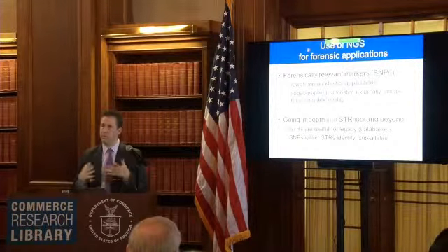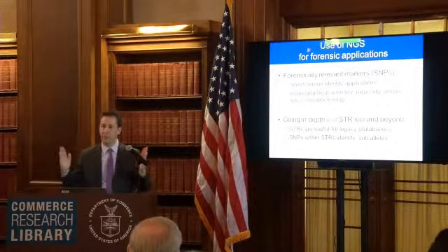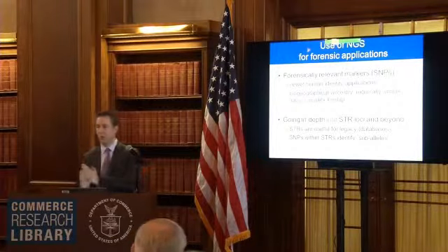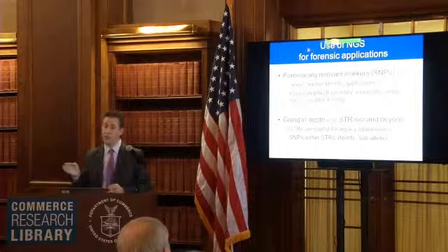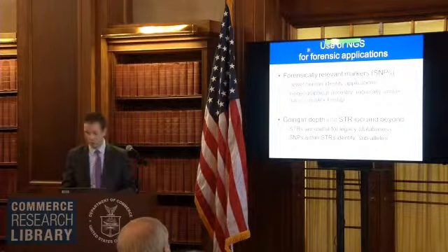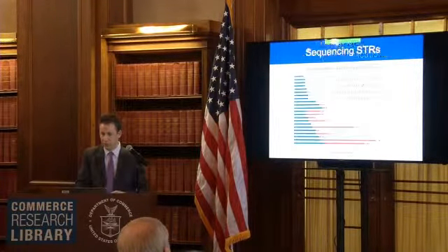What I've been talking about is a length-based way of typing, where the length of that product is associated with an allele size. But with sequencing, you might see some variation in the sequence that might give you finer resolution of the STRs as they exist now.